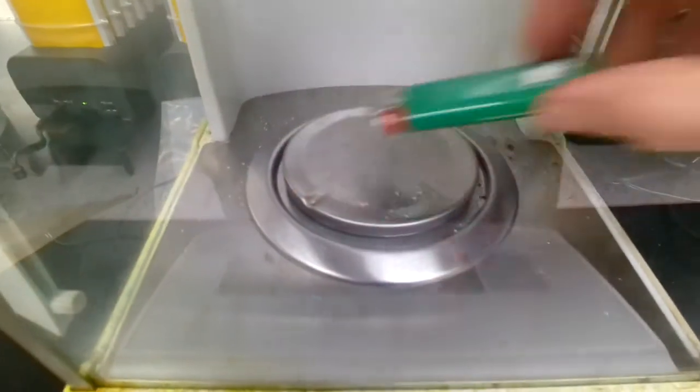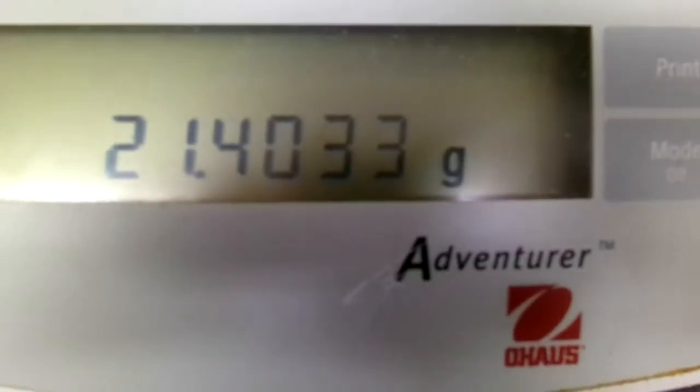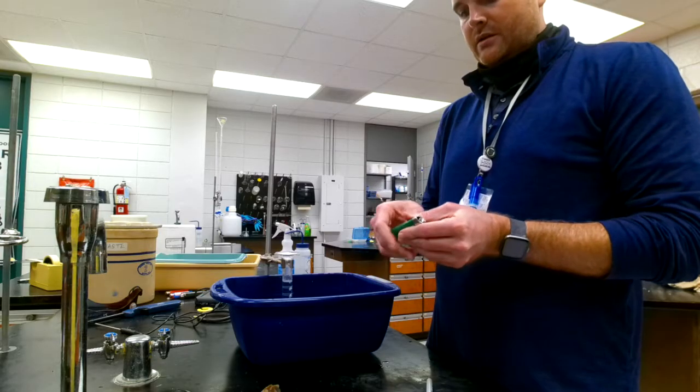We look at the lighter. That may have been because some of the label fell off, so we will remove that label on the next run, and we'll see if we can narrow it down. Oh, I forgot to write it down. It is 21.4033. Let's see if we can get another run in here.